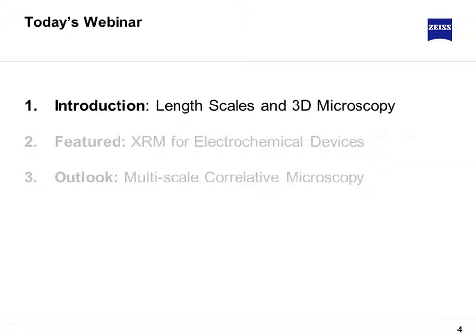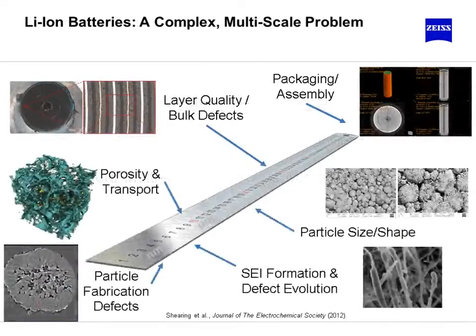So with that, let's dive in. What I'd like to show first is a collage of various images from battery materials. This multi-scale problem that we're looking at, if we start in the upper right on our ruler, we're looking at the macro scale, at packaging and assembly type devices at many microns of resolution, things like gross defects, and looking at more engineering type approaches.